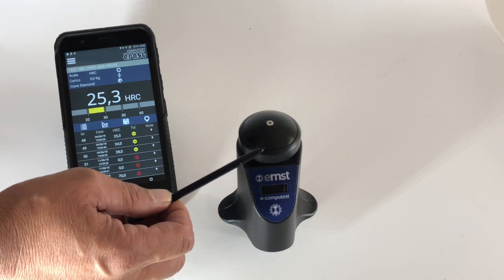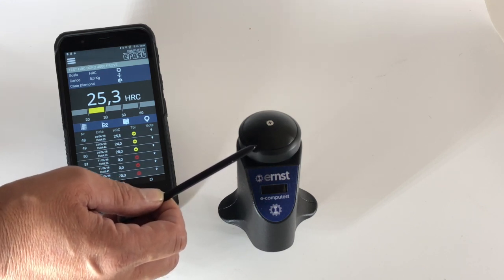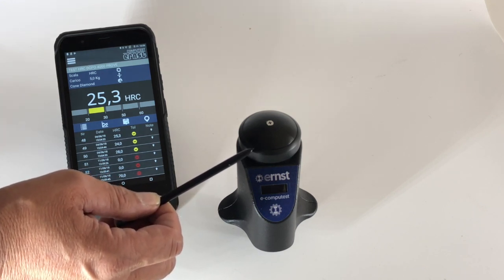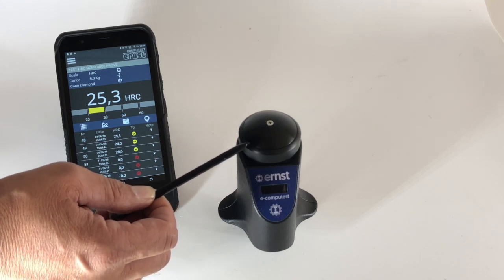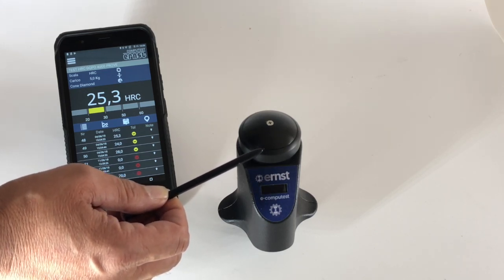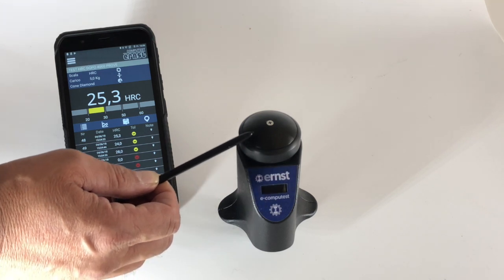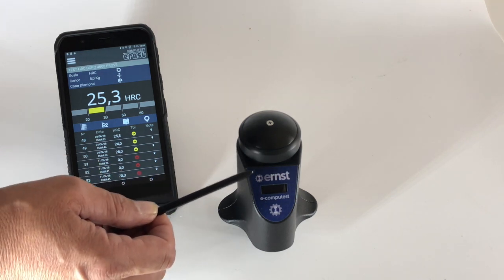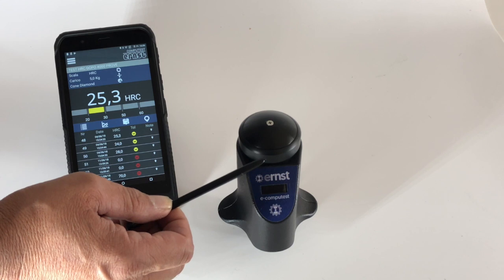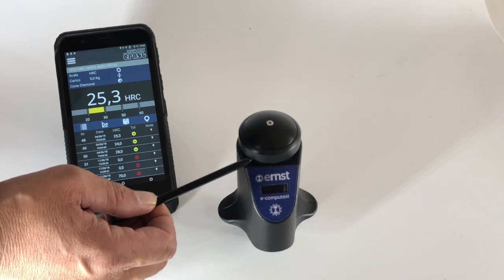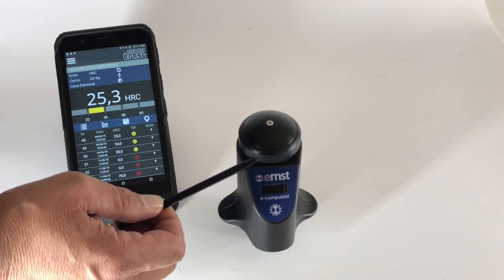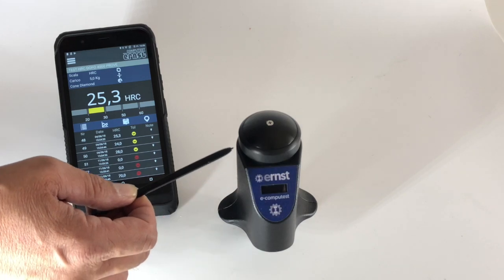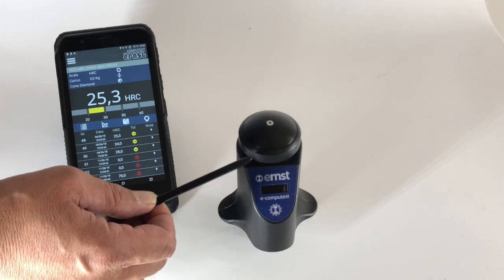And then we can have Vickers but also DP TH, which is depth. The repeatability of the instrument is better than one percent, or plus minus 0.3 HRC.